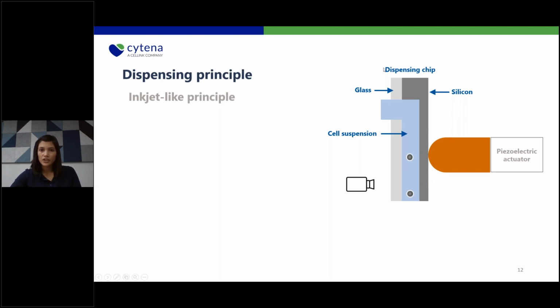This chip consists of a glass front side, and in the back there is a silicon membrane. And then we have a piston, and this piston is driven by piezoelectrics.